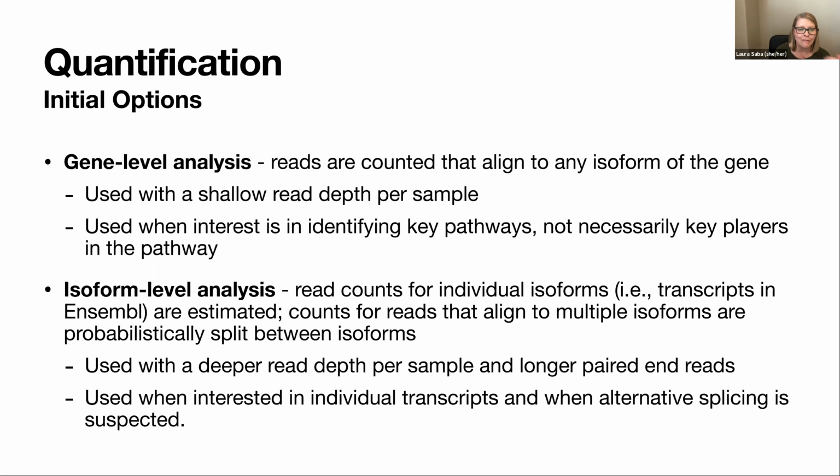Gene level, we're super confident in, because we don't have any of these ambiguous reads that align to multiple genes, or we have very few reads that align to multiple genes. But then you miss some of the information that may be important about different isoforms or splice variants having different functions, where the isoform level analysis is interesting, but there's more ambiguity on our actual read counts there.